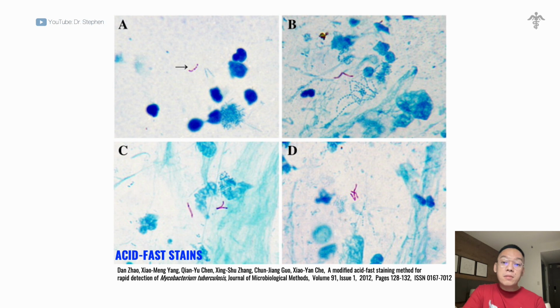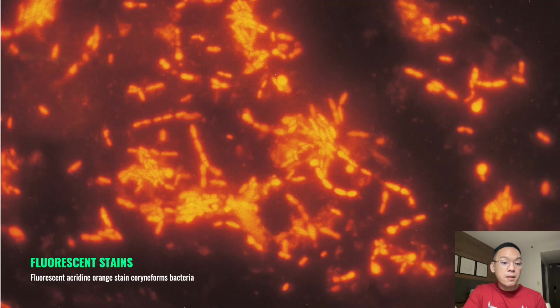Other organisms in this method will stain weaker, such as Nocardia, Rhodococcus, Tsukamurella, Gordonia, Cryptosporidium, Isospora, Sarcocystis, and Cyclospora. Because of that, these organisms can be stained more efficiently by using a weak decolorizing agent, and organisms that retain this stain are referred to as partially acid-fast.